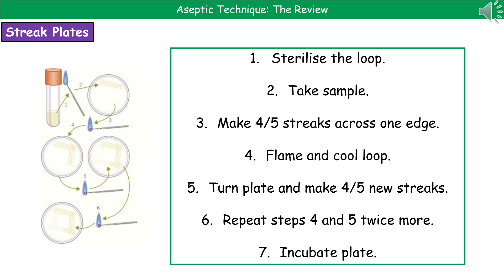Turn the plate and make four to five new streaks down the next side. Flame the loop again, then four to five streaks down the next side. Flame the loop again, then four to five streaks down that last side — making sure you don't join it back to your original streaks. The idea is not just to make a little box made out of bacteria on the plate, unlike some people on my degree course did. Each time you streak across and re-flame the loop, you're spreading the bacteria thinner, so that after incubation you will have individual colonies you can then select.